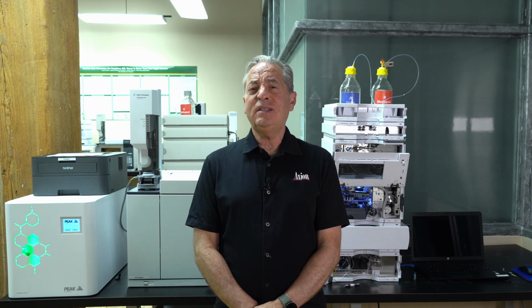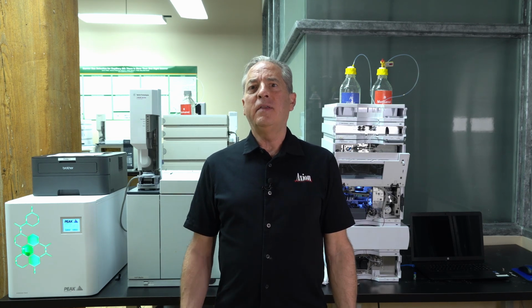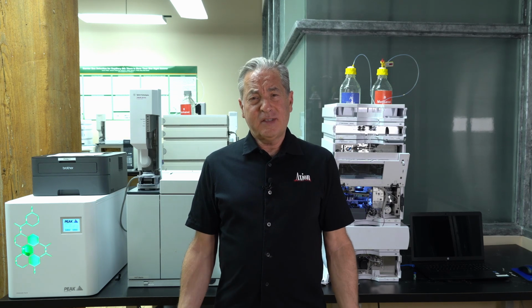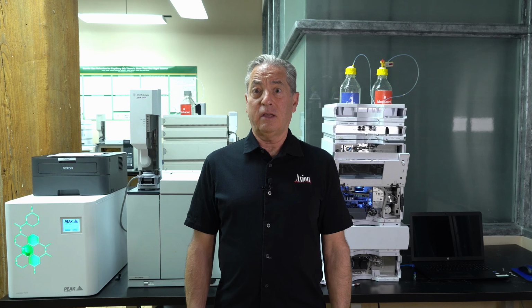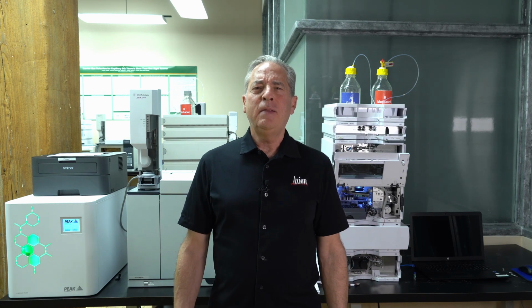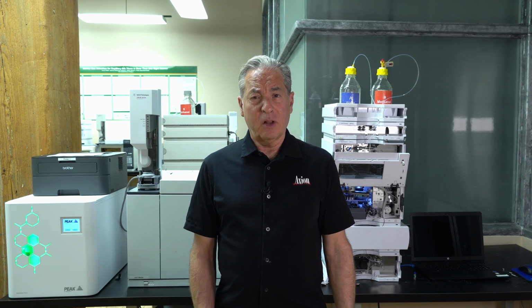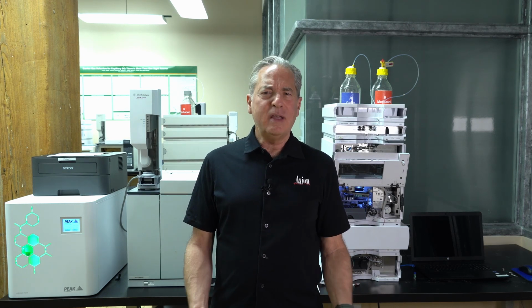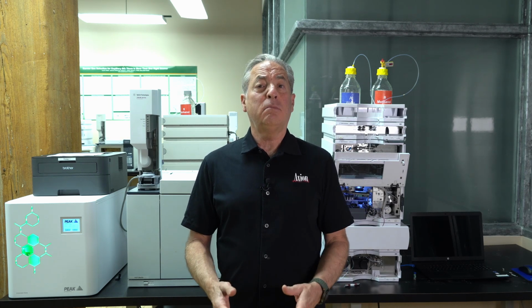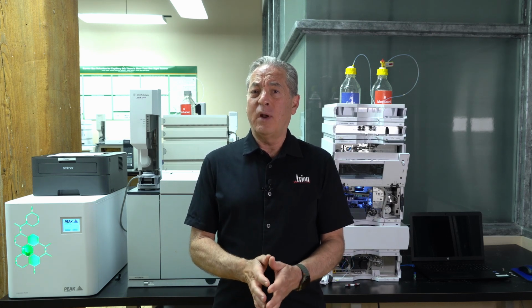So in GC, I would prefer the entire sample was volatile: the sample, the solvent, the matrix. If everything's volatile, GC is easy. If something's in the sample that's not volatile, like blood, which has proteins and sugars and salts in it, then we have to think about removing the non-volatile part of the matrix. Use something like headspace GC. So in GC, the fundamental rule is everything must be volatile in order to inject it. If not, we're going to have to deal with that residue.